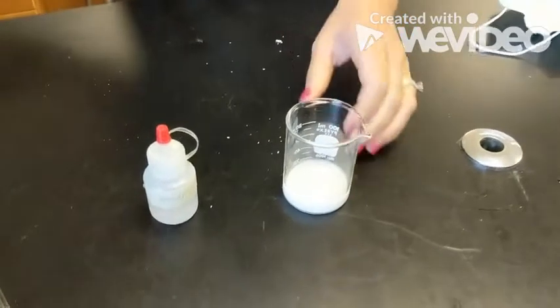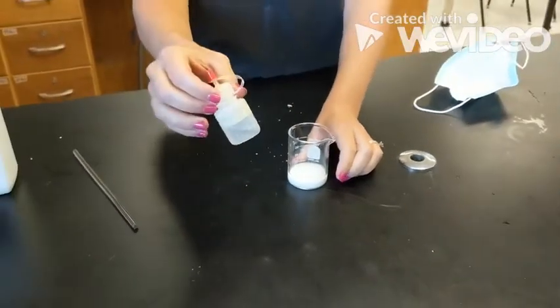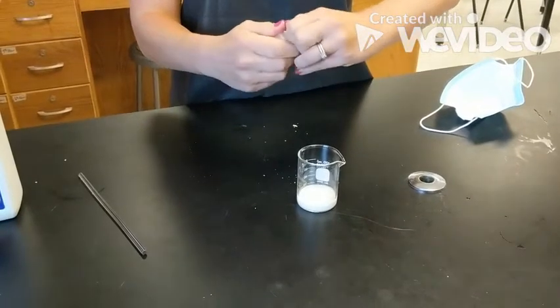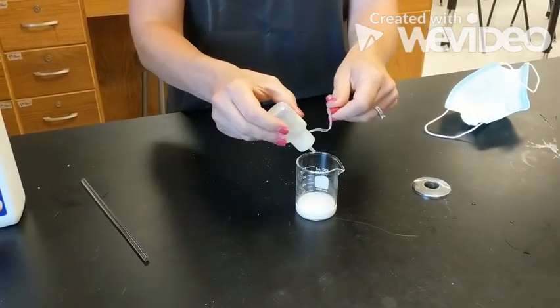and then I have a second substance here. This is phenolphthalein. You can note what state of matter it is, what color it is. And I'm going to go ahead and add a couple drops of this to our milk of magnesia, and make sure you're recording any reaction or any observations that take place during the reaction.